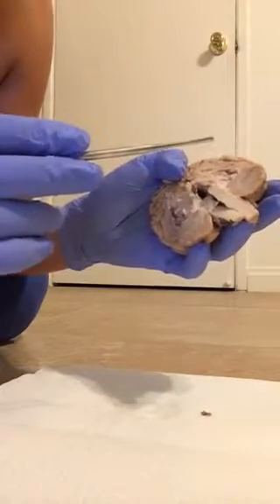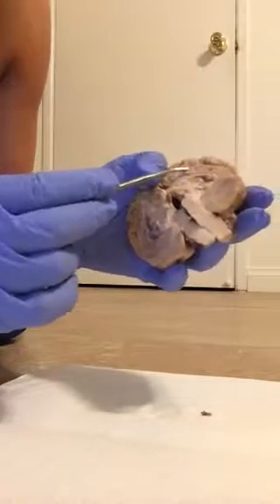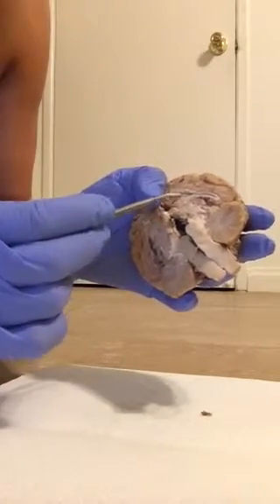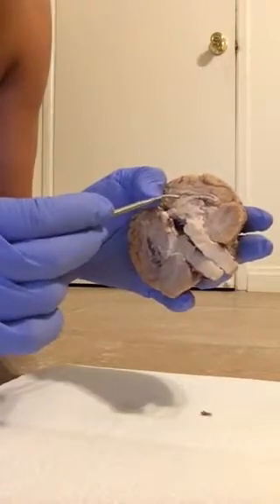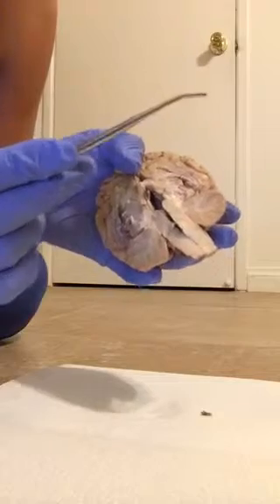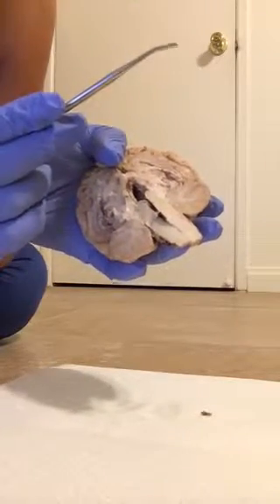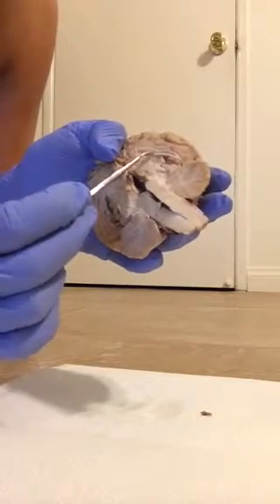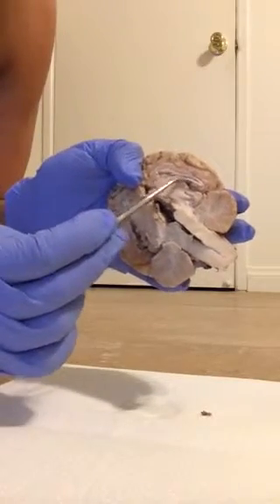And we have our corpus callosum, which is located here. It's a wider area. And we have our fornix, which is going to be here, the lateral area here.